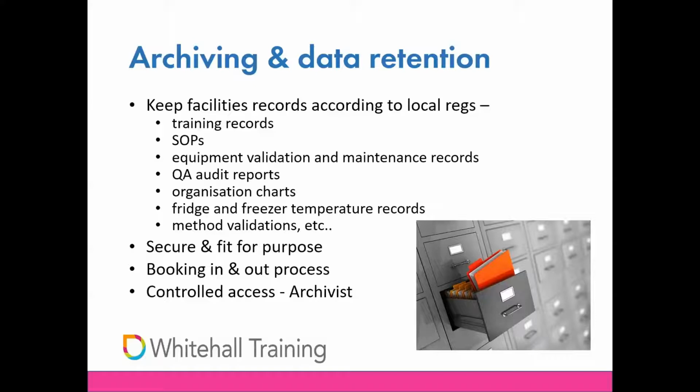So the facilities for archiving need to be secure, and they need to be designed to accommodate the type of material that's going to be stored. So this includes any electronic data storage, as I said before.